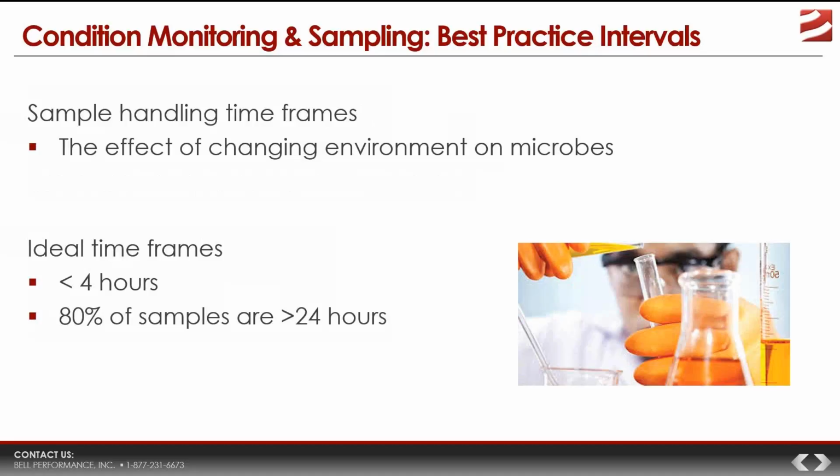Now, since microbes are living organisms, when you sample them, you're going to take those living organisms out of what's been considered to be their normal environment, because they grew up in that tank. That's what they know. They know that tank environment.